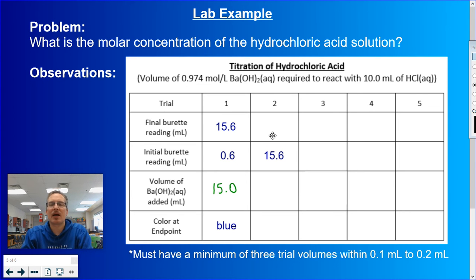So I'm going to run my reaction. This time I'm going to stop it at 29.3 because I saw the color change to green. One drop color change went from yellow to green, and my value then is going to be 13.7. You'll notice it is lower than the first trial because this time we did not go past the endpoint.